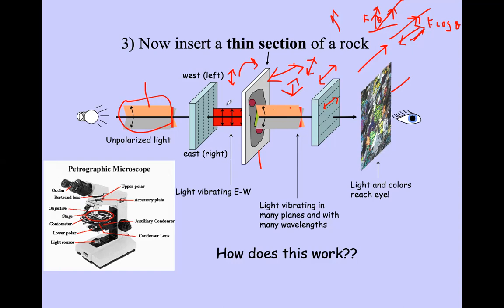If you want to see the natural color of the minerals, you have to observe when the light is passing through the first polarizer only. Here you can just observe with your eye, without inserting the second polarizer. You will see the natural colors of the mineral because the entire light beam is passing through.